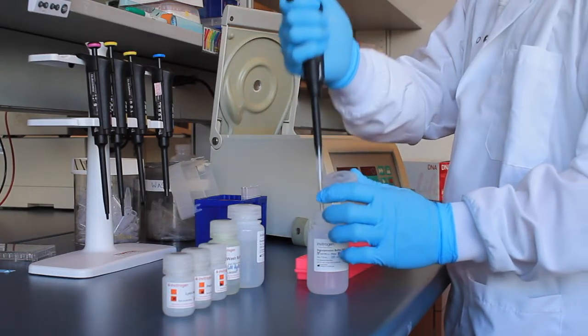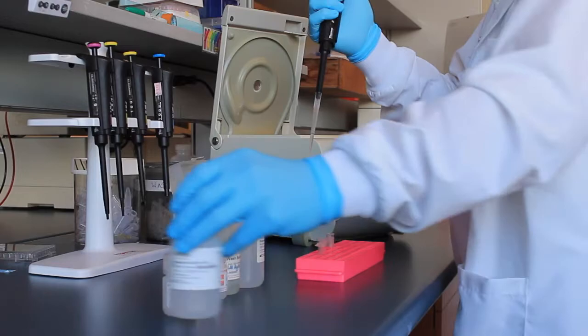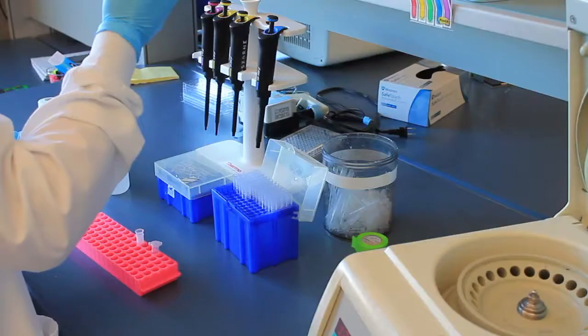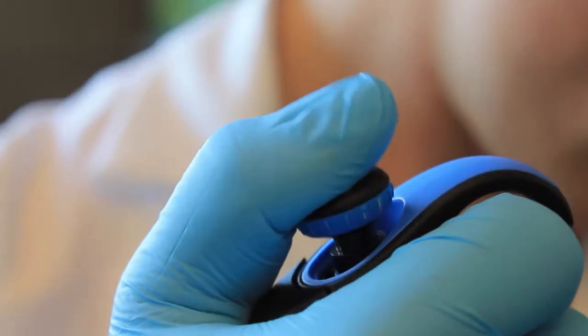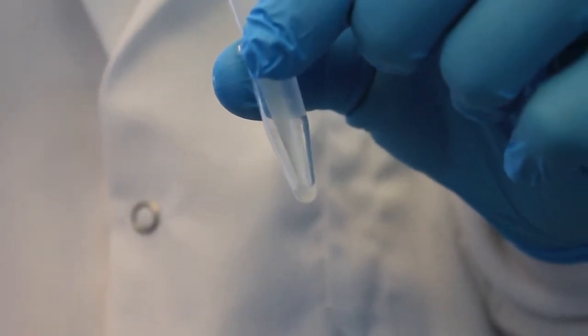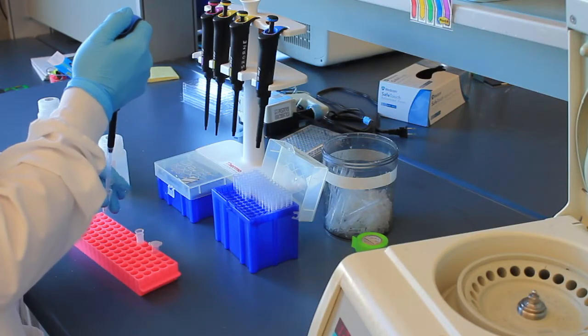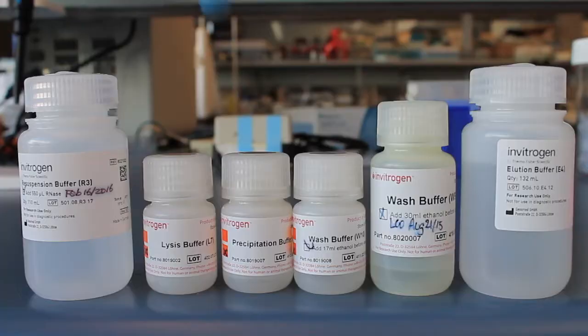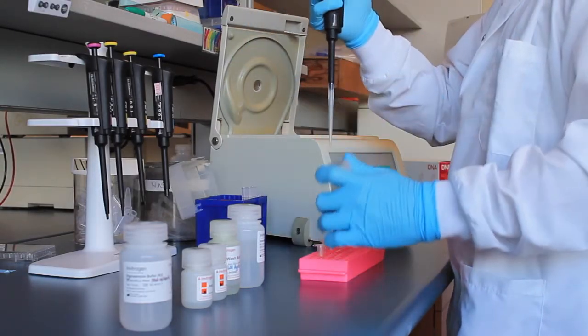Add resuspension buffer to your bacterial pellet and resuspend by pipetting up and down several times until a homogeneous solution forms. Once homogeneous, add lysis buffer, mix gently, and incubate at room temperature for 5 minutes.